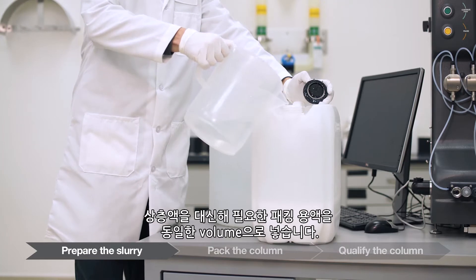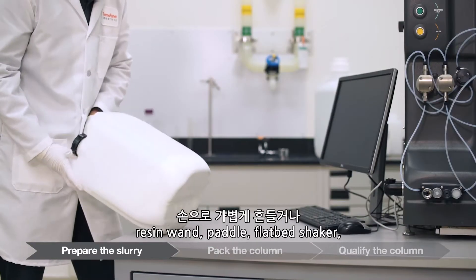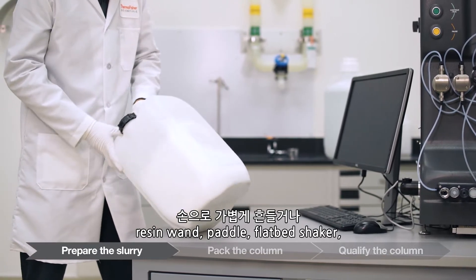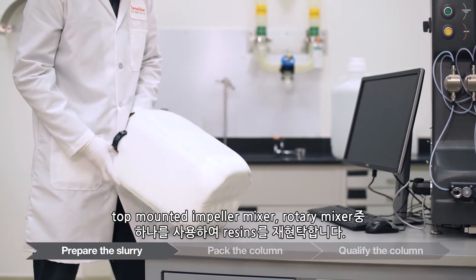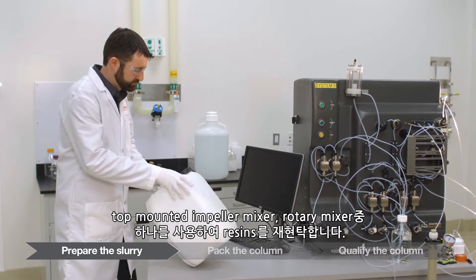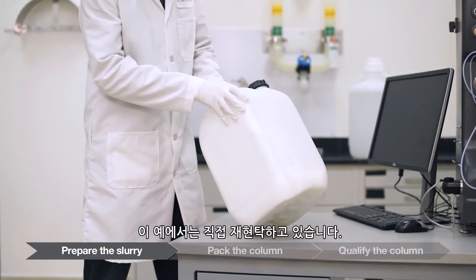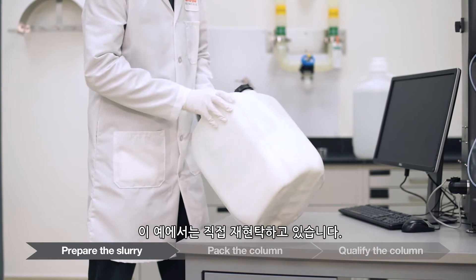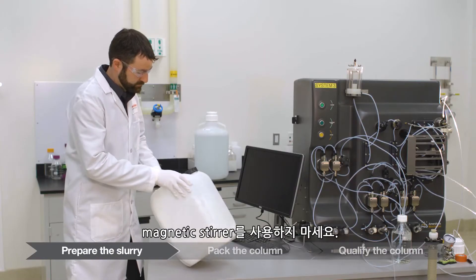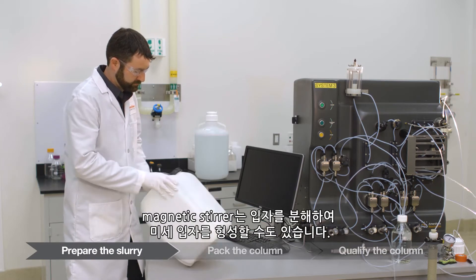Replace the supernatant with the same volume of the desired packing solution. Re-suspend the resin by gentle agitation by hand, resin wand, air sparging, paddle, flatbed shaker, top-mounted impeller mixer, or rotary mixer. Then allow the resin to settle by gravity. We are demonstrating resuspension by hand in this example. As with any resin, do not use a magnetic stirrer, as it may abrade the particles and cause fines to form.